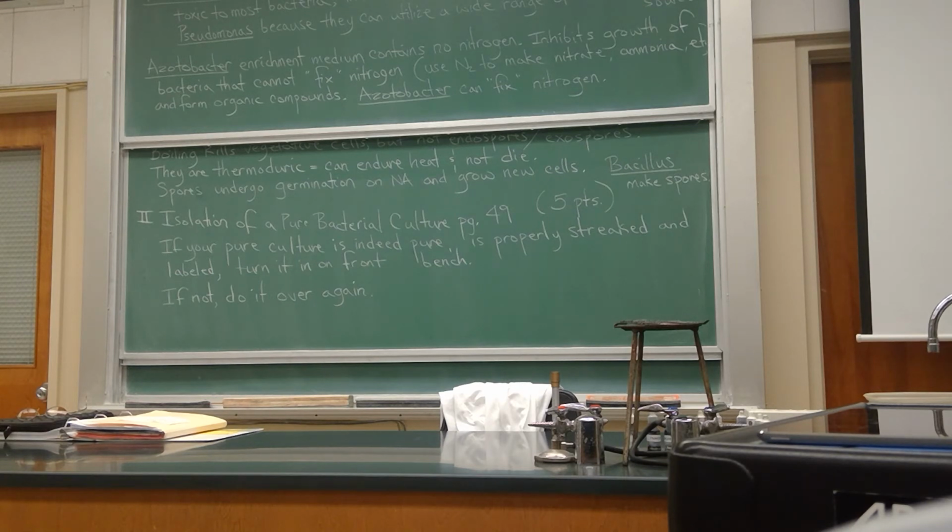You need your lab coats on. We are working with mix A, mix B. Remember, our mixed A cultures are potentially pathogenic. If you left your plates in the incubator on Thursday night, they are over here on the side bench. So what's over here is Staphylococcus and Klebsiella.